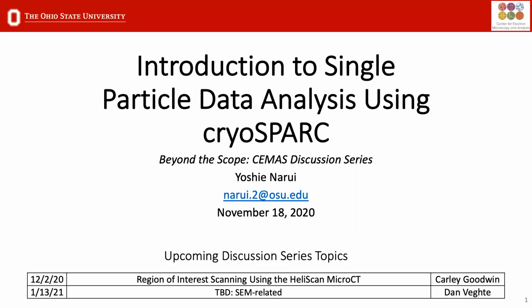Okay, I'm just going to go back to the presentation now. Those are pretty standard parts of the workflow, and there's not a whole lot you would vary. The next step is where you have some more choices of how you want to do things. You're going to start picking the particles from the images at this point. You want to successfully pick all the particles, but no junk particles, so nothing that might look like a particle but really isn't.